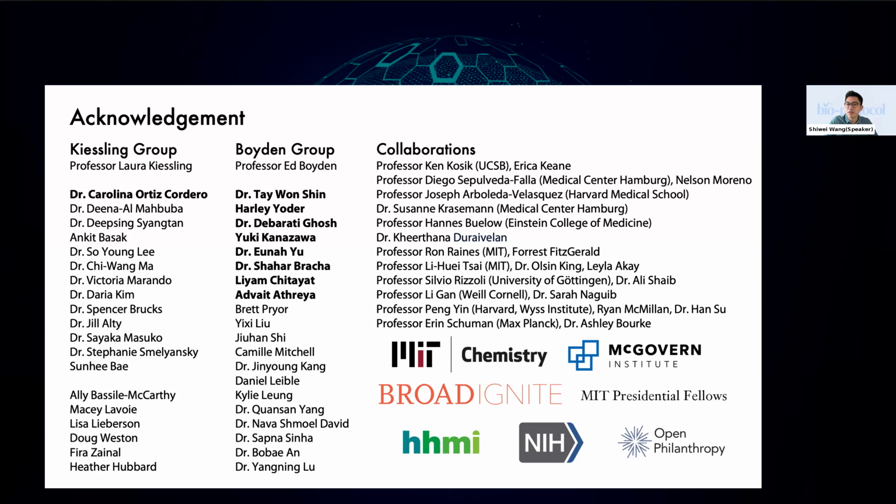I think other methods are definitely possible, but you will need to do optimization because the polymer kinetics might be different. Thanks. Valentine also asks, have you checked if potassium is critical versus traditional APS? We haven't. We use potassium because that's what the original chemistry paper used, and that's what the X10 paper used. And since it's not super expensive or anything, we just kept using potassium persulfate.